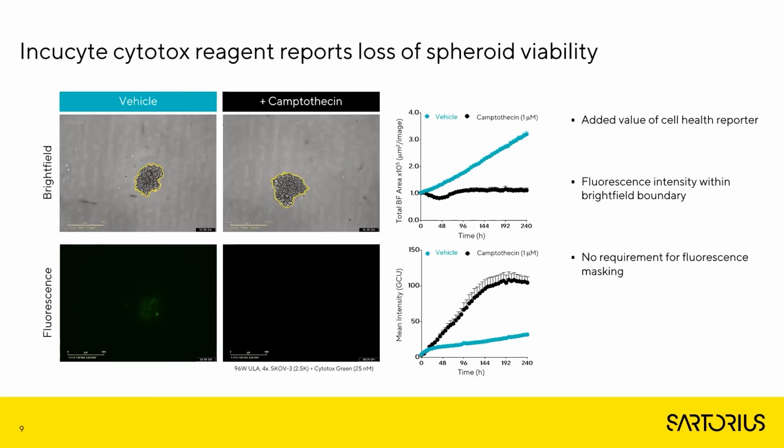The fluorescence videos show a strong fluorescence signal in the treated, smaller spheroid and a much dimmer signal in the larger control one, which reveals itself much later in the time course. There also appears to be an overlap between the bright field and fluorescent images with respect to the debris, suggesting that we are clearly looking at dead cells here.